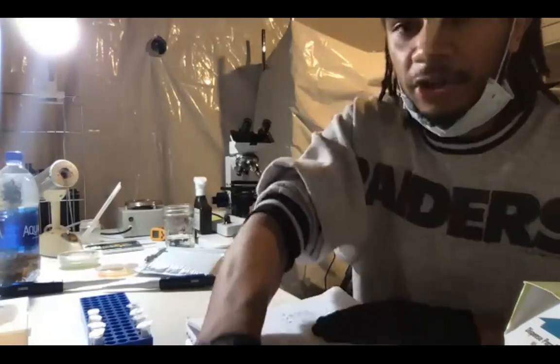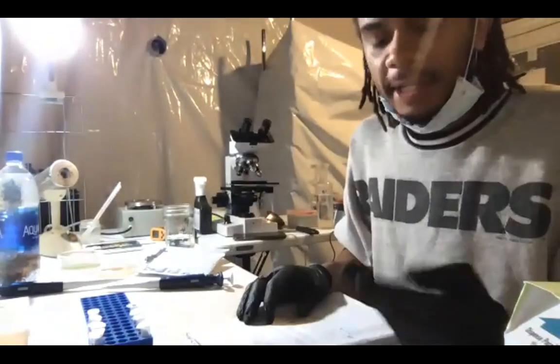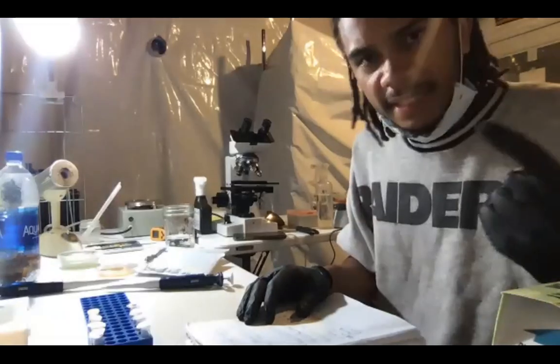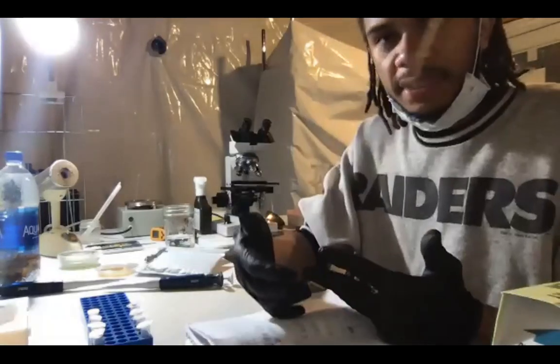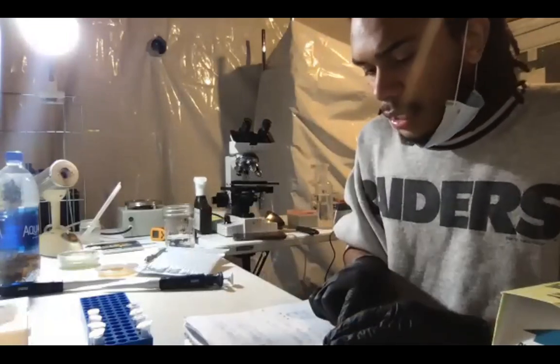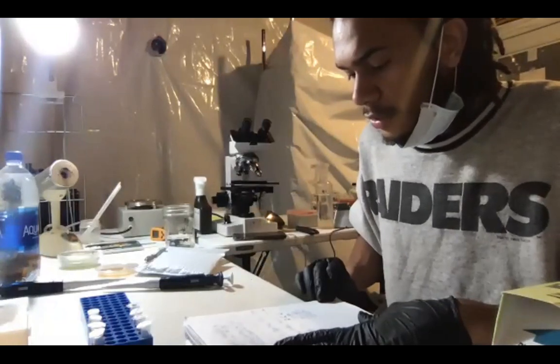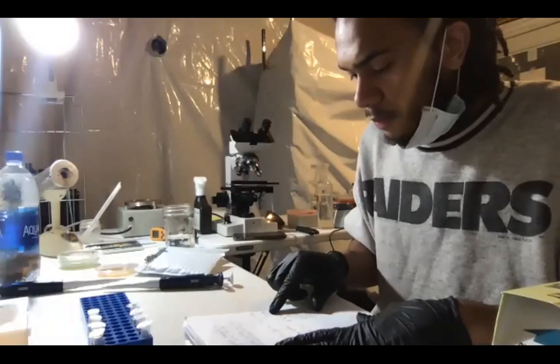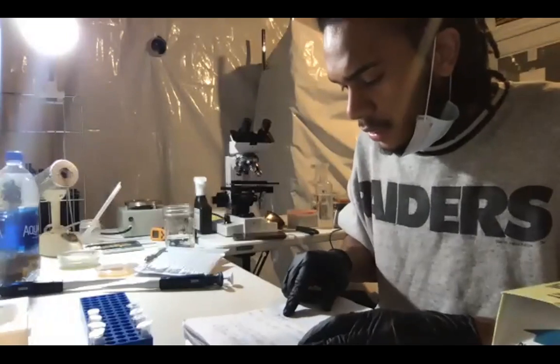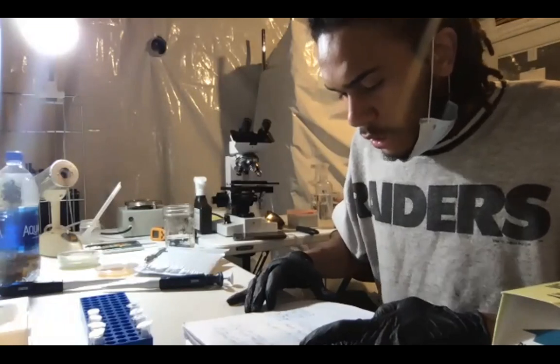Master mix has the blank bases for the DNA. So it has the A, C, T, G, which will bind with the opposing side of the DNA that you're trying to copy. That's what the master mix is for. And then you're going to add water. So the water volume equals 200 minus the 100 for the master mix, minus 8 and 8 for the forward and reverse primers.